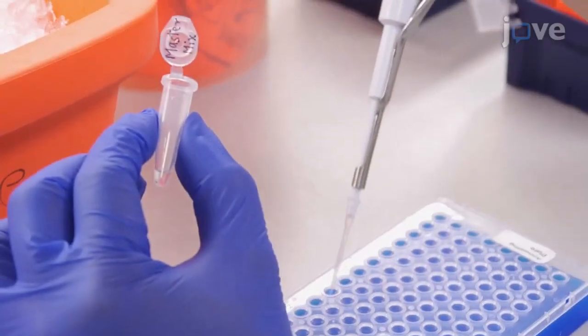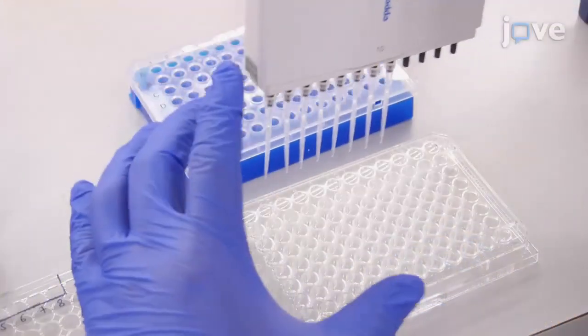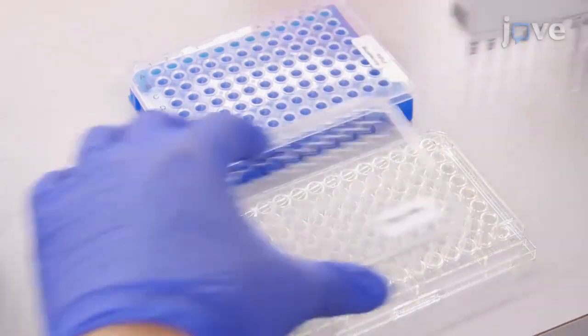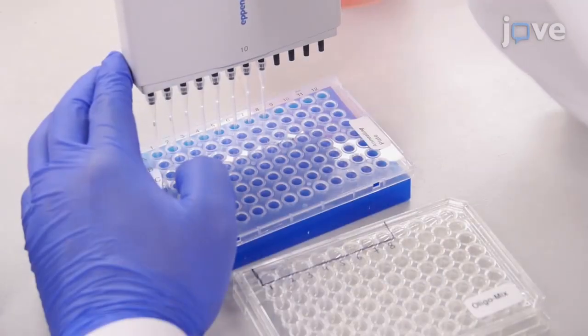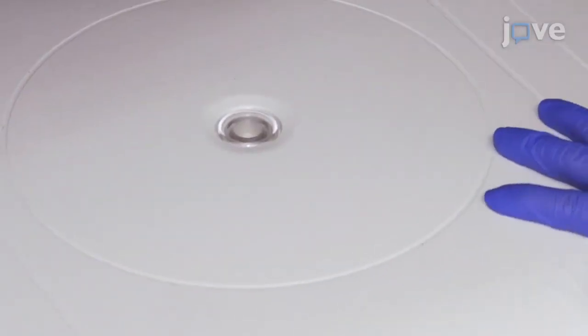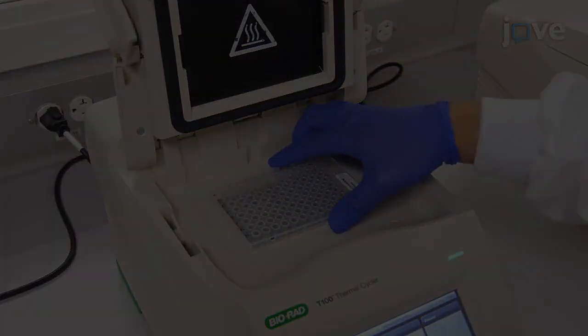Add 8 µL of the master mix to each well of the annealing plate, followed by 2 µL of premixed sense and antisense oligonucleotides. Pipet 2-3 times gently to mix well, and then spin the plate briefly to get the mixes to the bottom of the wells. Use the following annealing program in a PCR machine.